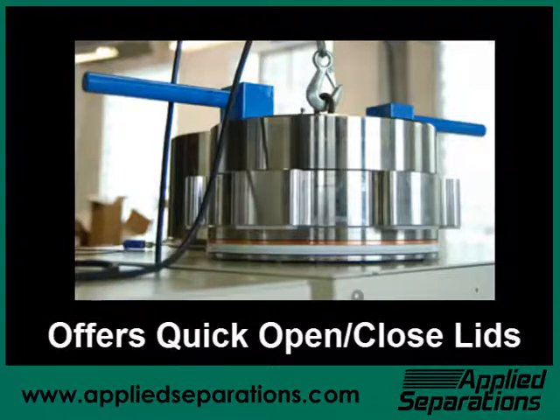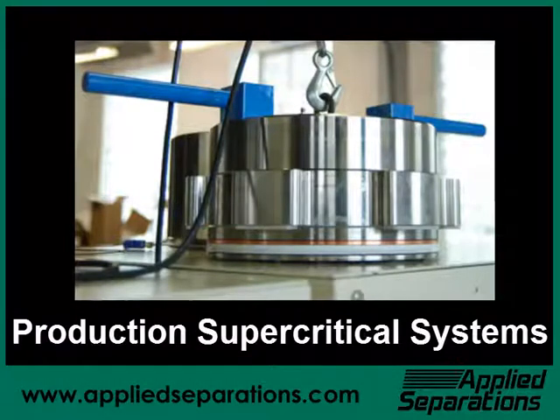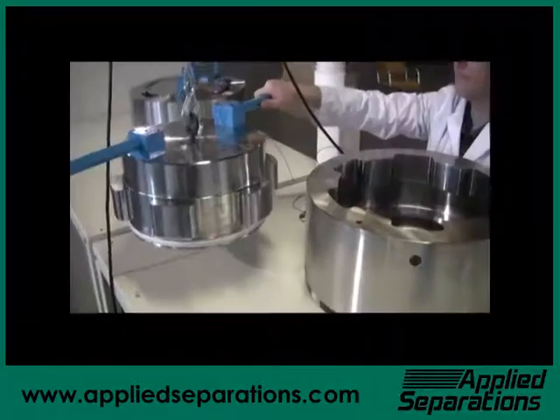Applied Separations offers quick-locking, quick-close lids for the 100-liter, 250-liter, 500-liter, and larger high-pressure vessels used with their large-scale and production-scale supercritical fluid systems.